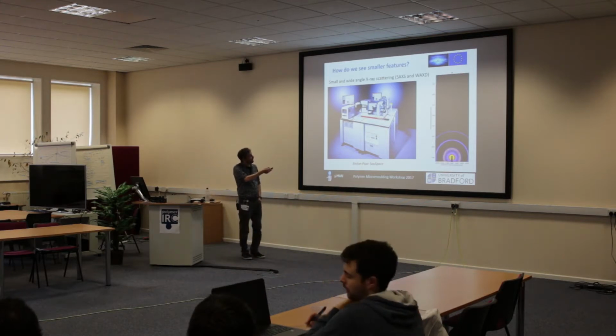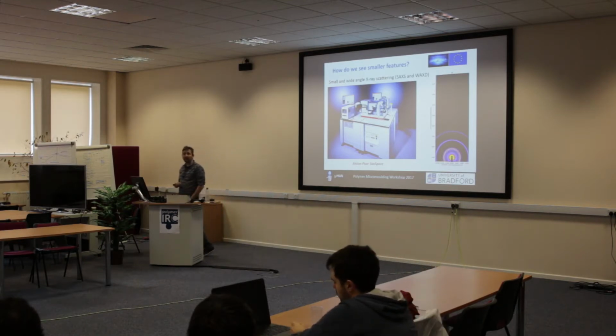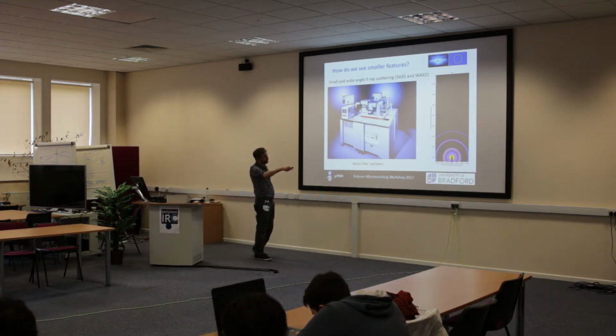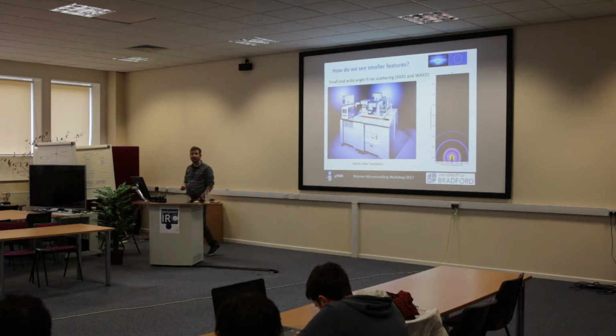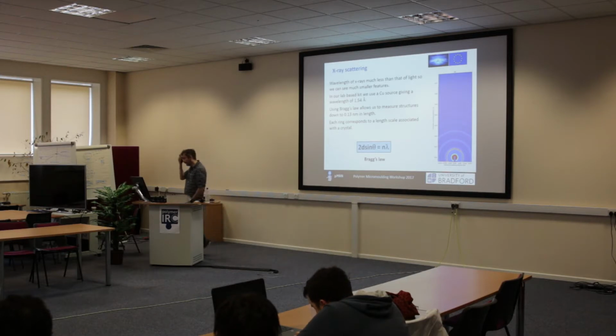So we have an X-ray generator, we have a camera, and we bounce X-rays directly through our sample. Okay. We end up with scattering diagrams something like this. Each ring is associated with a length scale within our material. It's associated with a crystal form within our material. That's simply a silver behenate, so it's a very nice scatterer, so I know exactly what it's doing.